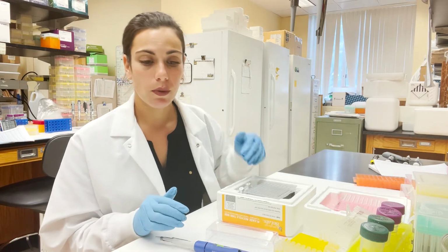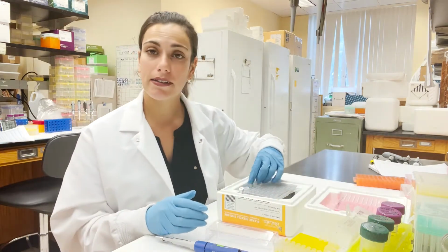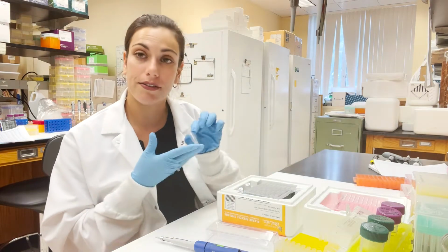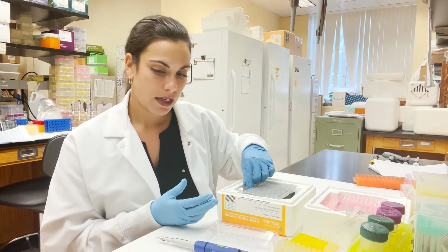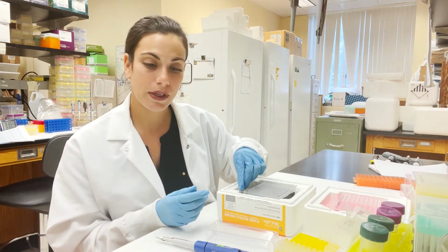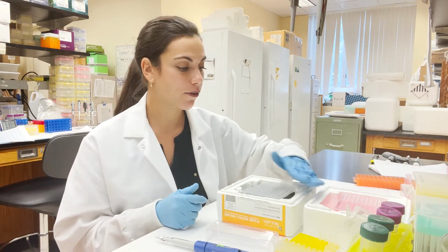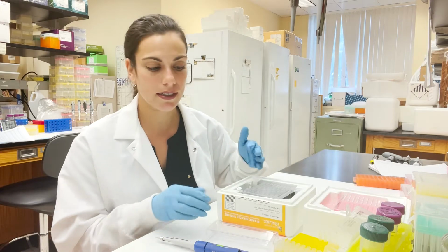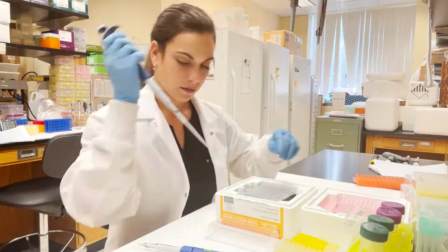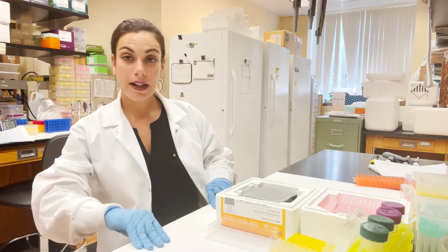So in each well, we'll have 11 microliters of nuclease-free water, 4 microliters of ATP, 1.5 microliters of our common adapter, and then 2 microliters of our NE buffer 4. And we multiply all of that by 54 because I have 48 samples here plus an extra 6 to allow us to work in the multi-channel pipette. So now we have our master mix.